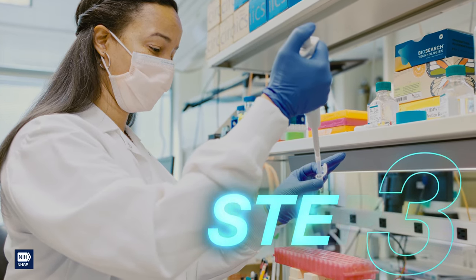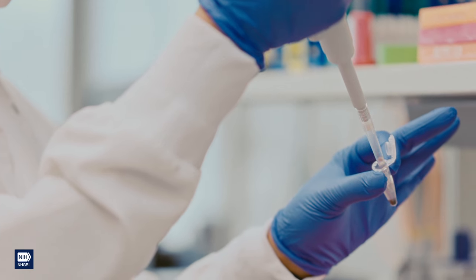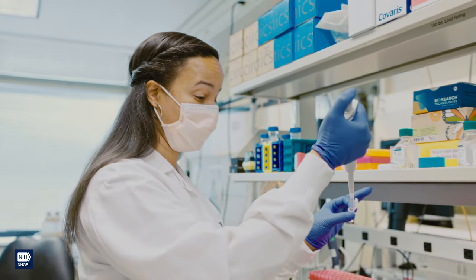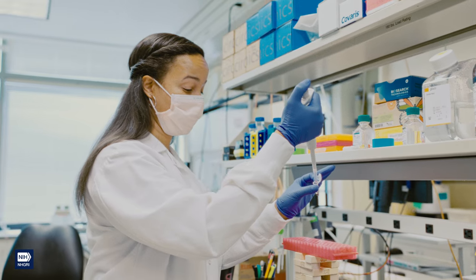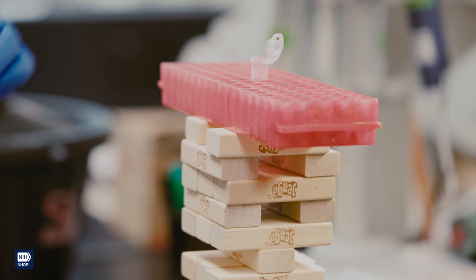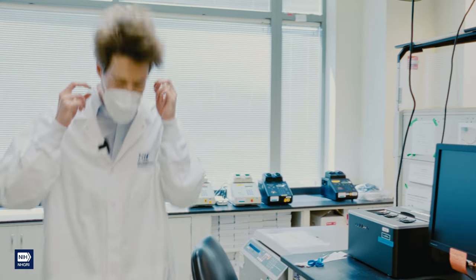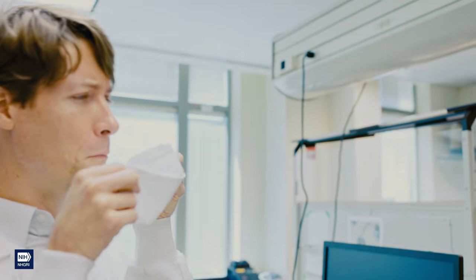Step 3: Once you have the cells collected, you can extract the DNA and get it ready for sequencing using some chemicals. You need to do this very carefully so that the DNA doesn't break into pieces. I leave these next few steps to the experts at NIH. When you're done, if it looks like a glob of snot in the test tube, you're on the right track.